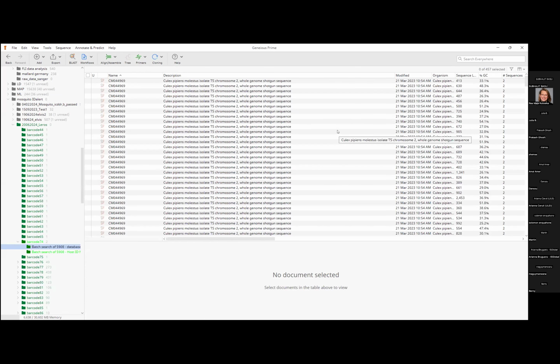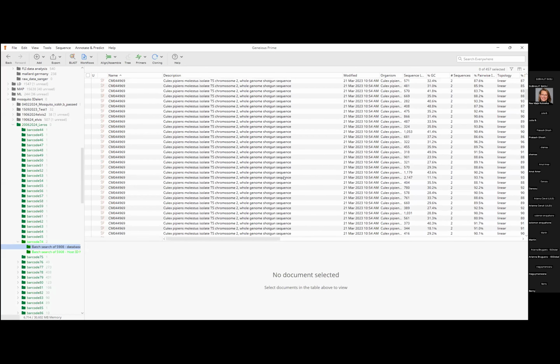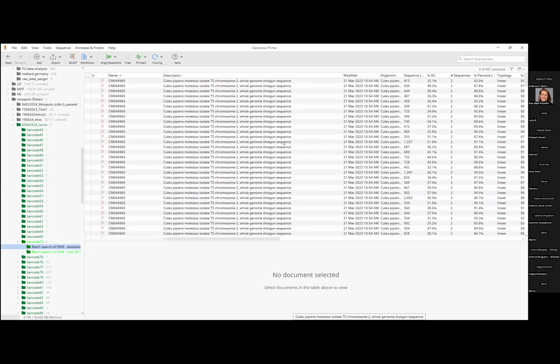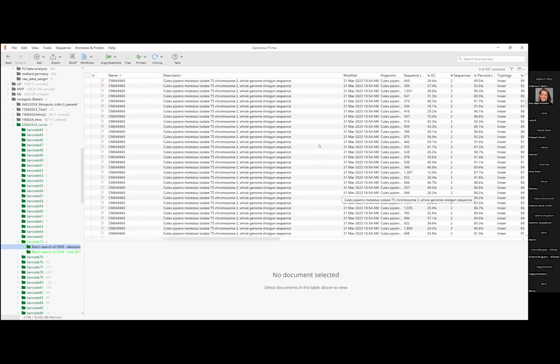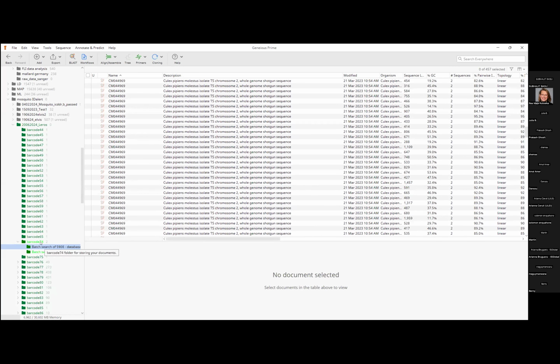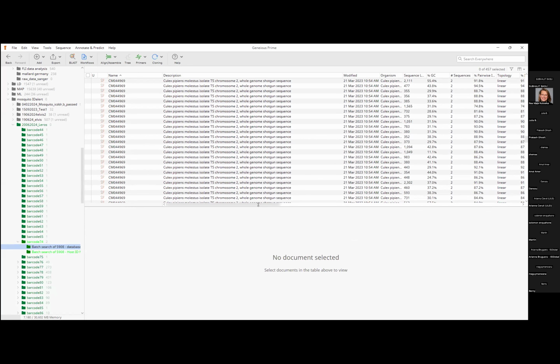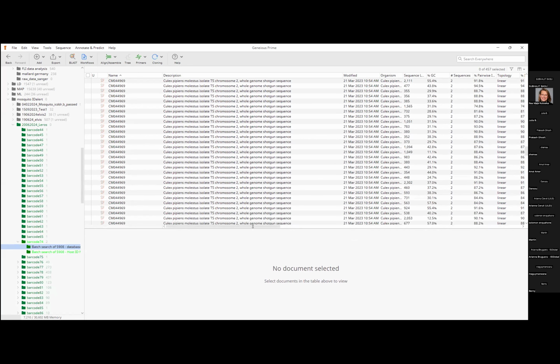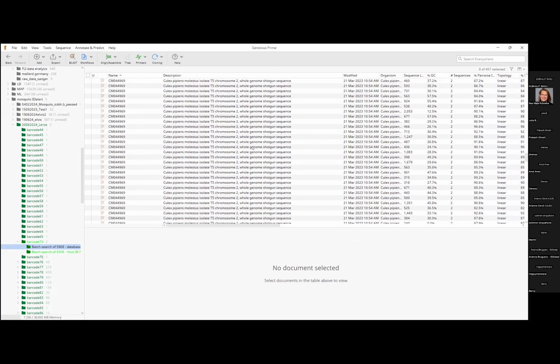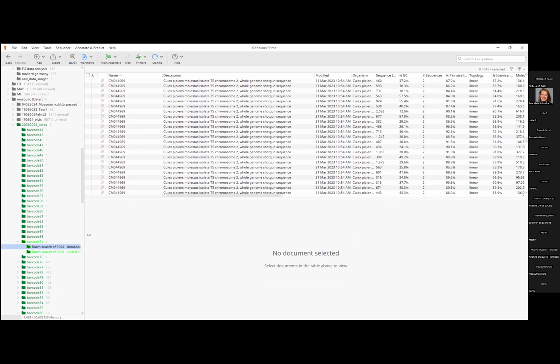So in this case, this is what the Geneious software will tell you. Oh, here I have tons of similarities with Culex pipiens molestus. Culex pipiens, some of you might know, is a very common mosquito. And in this case, the DNA from this barcode, from this sample, matches with Culex pipiens. So I can say with a certain amount of probability that this is a Culex pipiens mosquito. Yeah, very simple, 4 clicks, and Geneious will tell you what it finds.